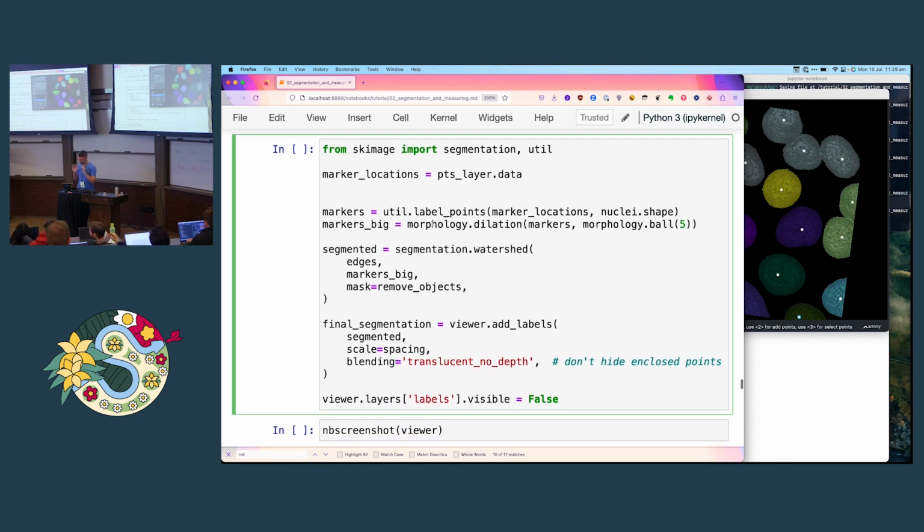Okay, undo just breaks all the time for some reason. Yeah. All right, so there you go. You have your separated nuclei in 3D. I could go and fix that, but I'm not going to. All right. Any questions about that? Nope. Good. Okay.